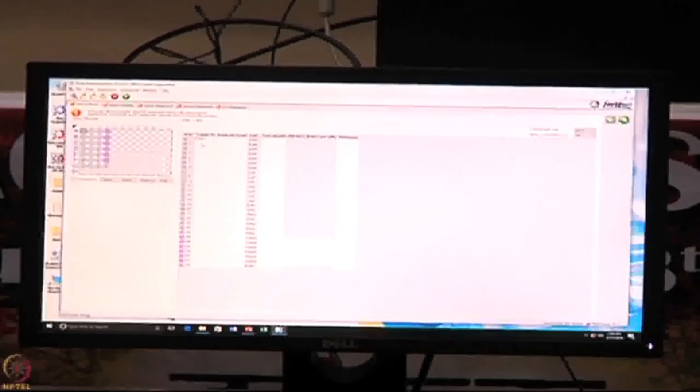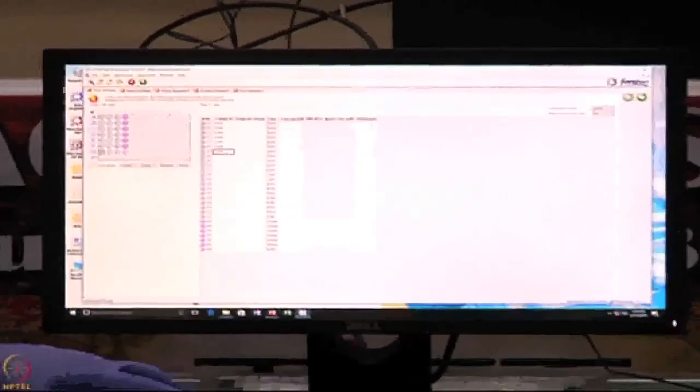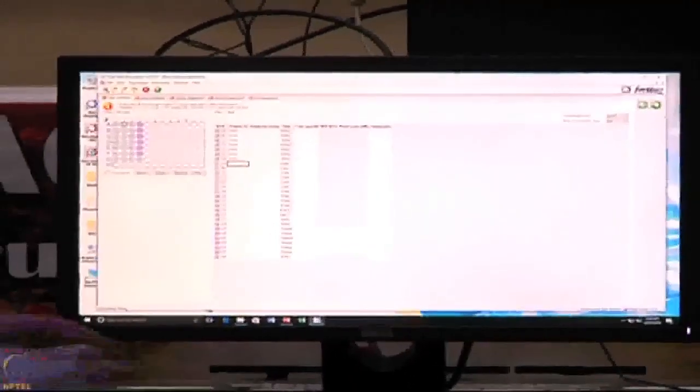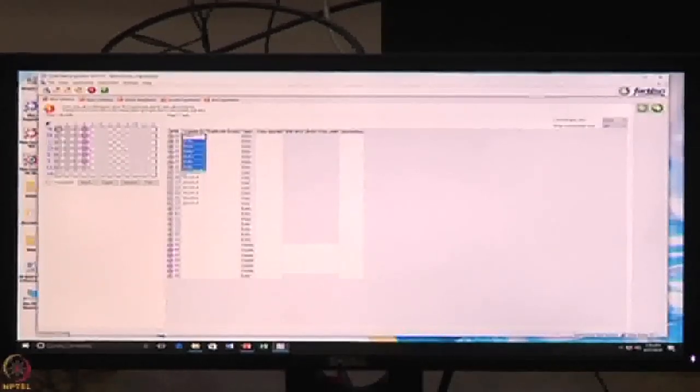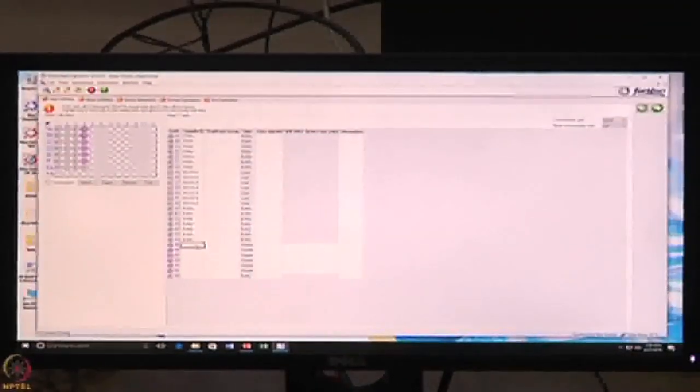We have to feed this in the template. In the sample ID, what you fed, the buffer. So control C, it typically looks like an Excel sheet. Then the load, you have biotin protein A. Then once again you have buffer, right? Control C, and then the buffer. Then you have mouse IgG.